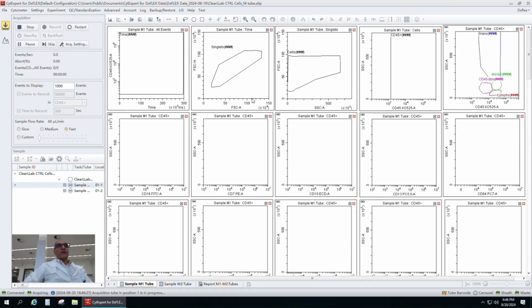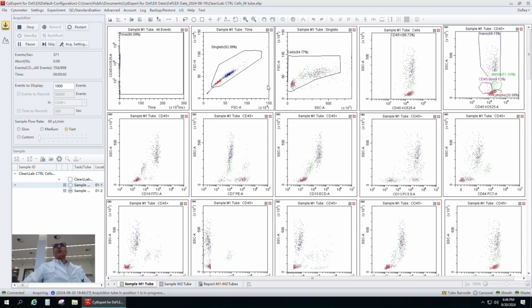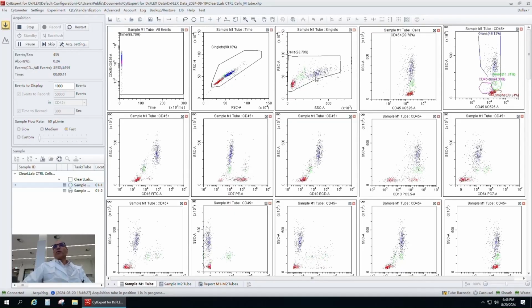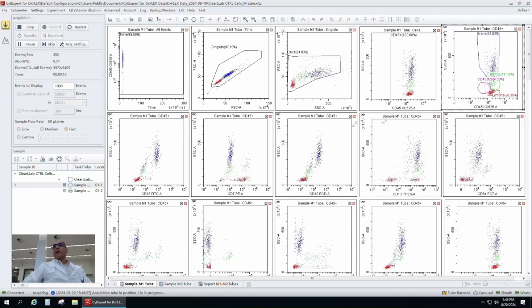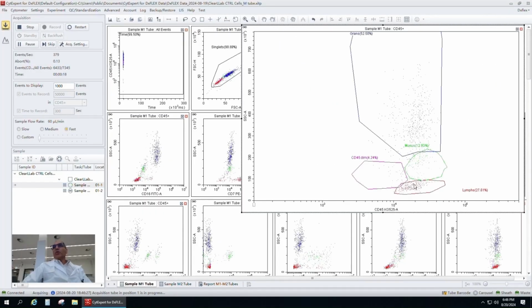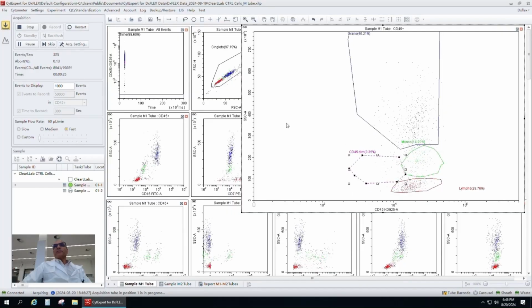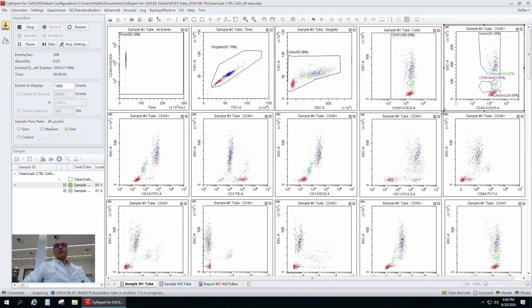The same strategy from the templates available on the Beckman Coulter website, where you see here forward scatter doublets discrimination with the area and the height of the peak. You have also the forward scatter, side scatter to eliminate debris. And then you have the cartography of the cells again with lymphocytes, monocytes, neutrophils, plus the immature cells here with a dim CD45 expression.